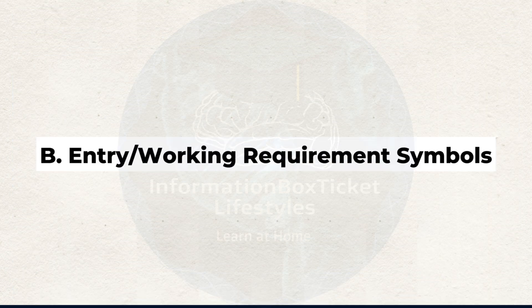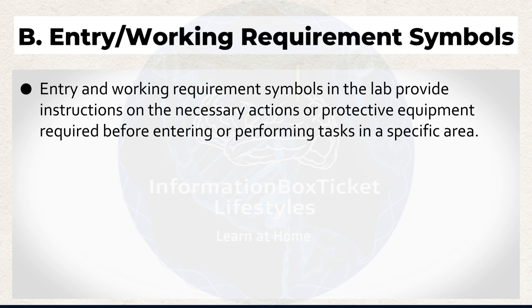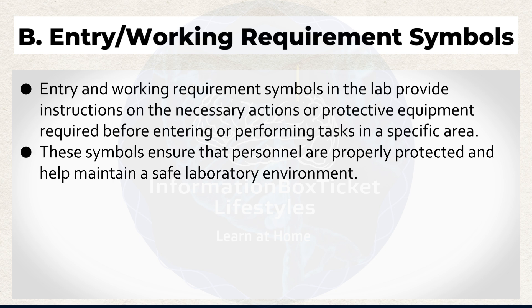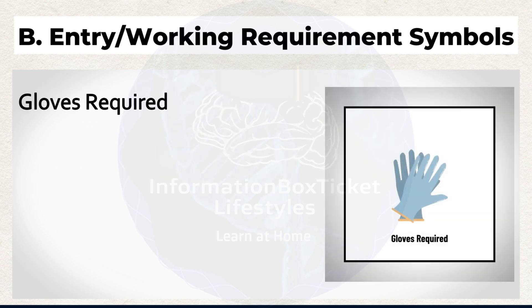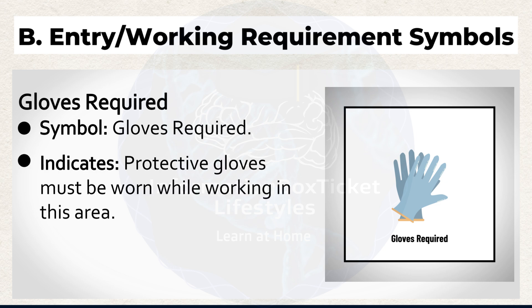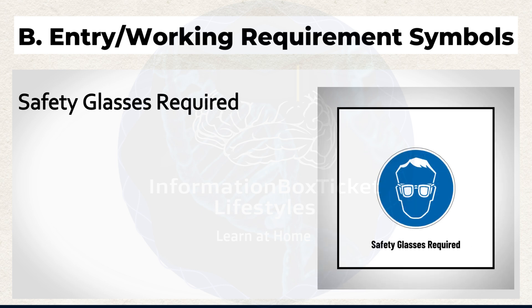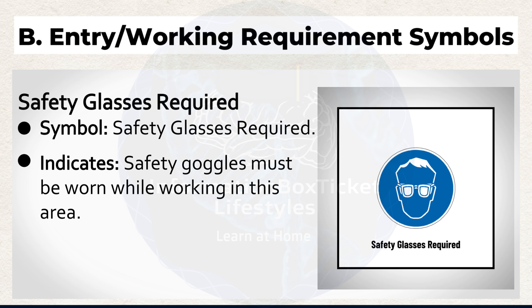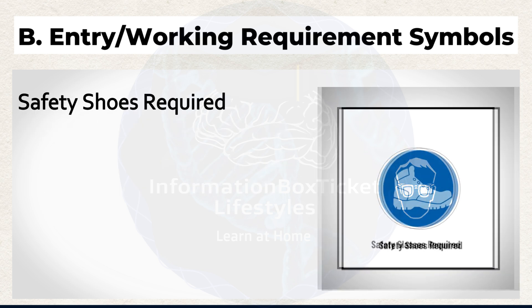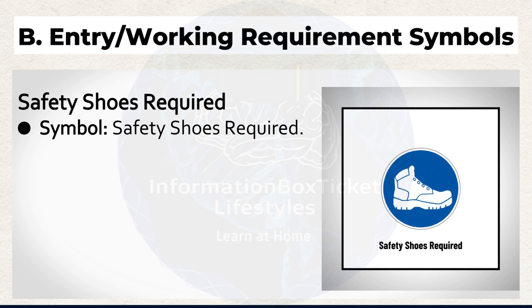B. Entry and working requirement symbols in the lab provide instructions on the necessary actions or protective equipment required before entering or performing tasks in a specific area. These symbols ensure that personnel are properly protected and help maintain a safe laboratory environment. Gloves Required symbol indicates that protective gloves must be worn while working in this area. Safety Glasses Required symbol indicates that safety goggles must be worn while working in this area.